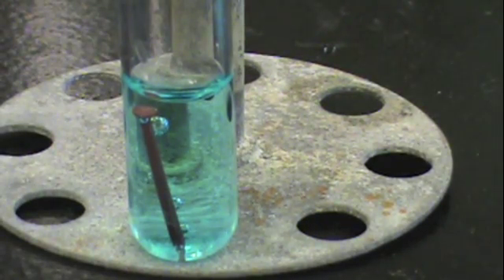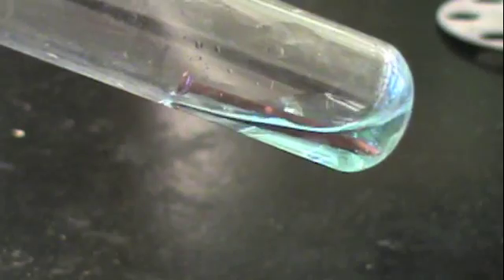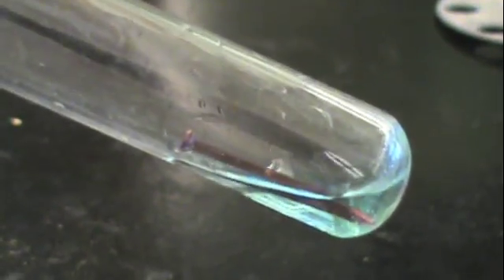After a minute and a half, we see that the nail is even more reddish-brown. And when we decant the copper sulfate, the nail is quite red, indicating that copper has been deposited.